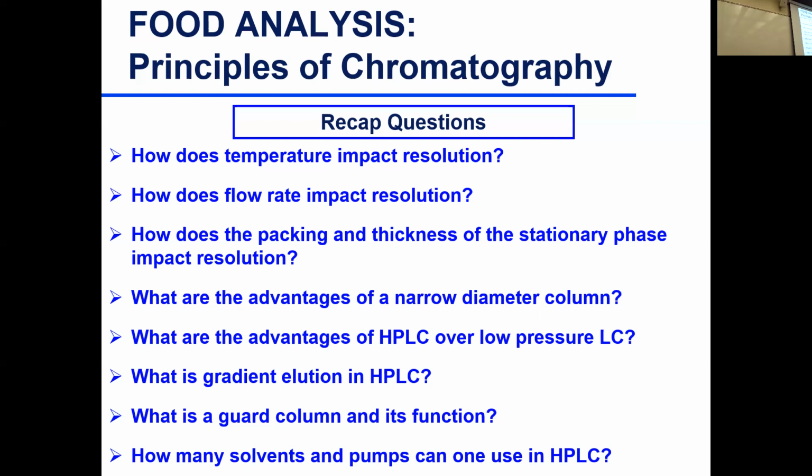It's just to simplify a little bit, gradient elution, you're just changing the concentration of the solvent over time. And this is to reduce your analysis time. If you have good separation, you can reduce your analysis time so that your compounds don't take forever to leave the column. They will leave eventually, but with increasing their concentration, you shorten the analysis time.